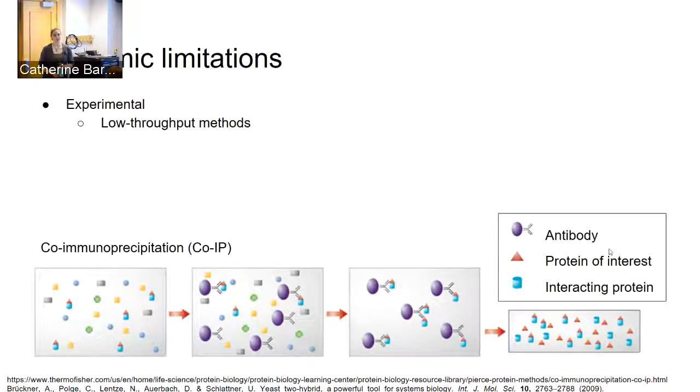Yeah, for sure. There's another nice method, it's fluorescence-based, that uses a pair of fusion proteins, where you have one thing that acts as a bait, tethers to one end of the cell, and then the other one acts as a prey and has a fluorescent protein attached to it. You can see if you induce polar localization of a non-polar protein, which works in a more high-throughput way. So BiFC? What? BiFC. Yes, that's right.